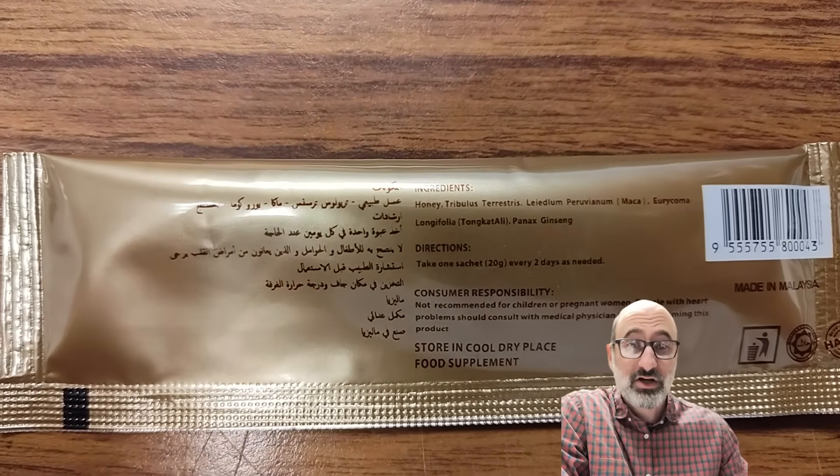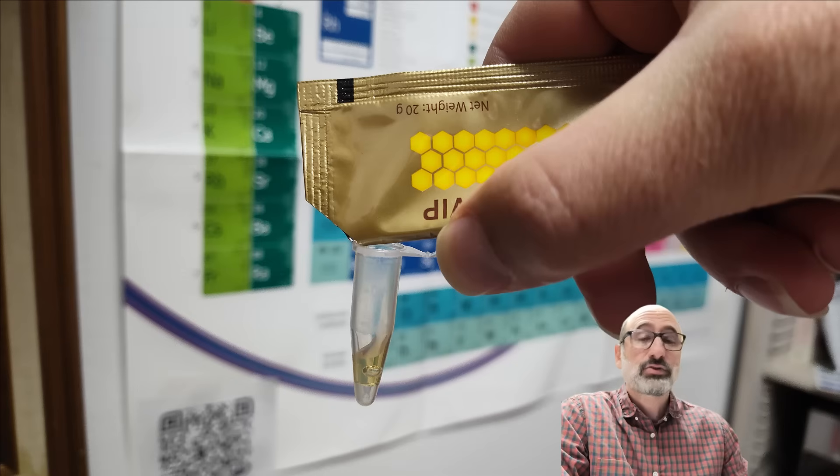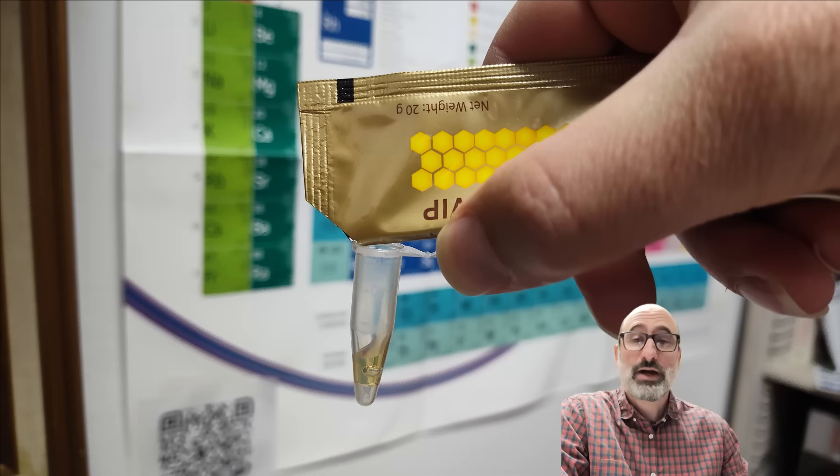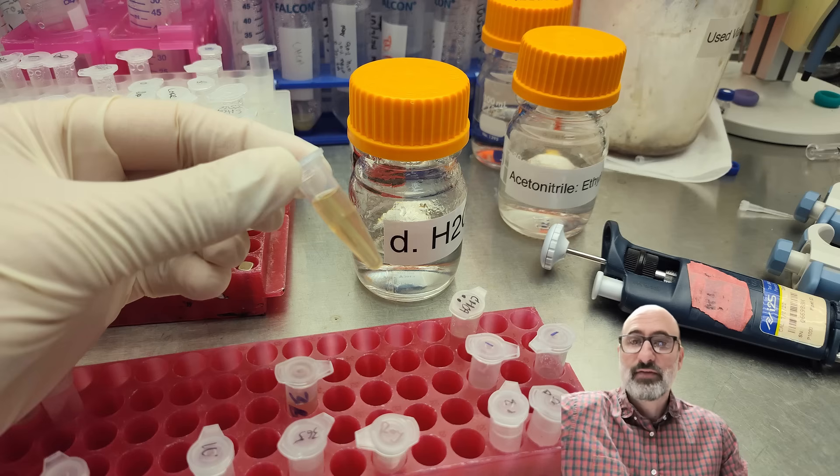Now, we're going to do another piece on the tongkat ali and potentially the testosterone effects from this tongkat ali. Anyways, we diluted this guy out, and we're going to put it onto the LC-MS. So this is really simple. We're not going to lose anything. We're not pelleting anything out. We're just taking the honey directly out of the packet.